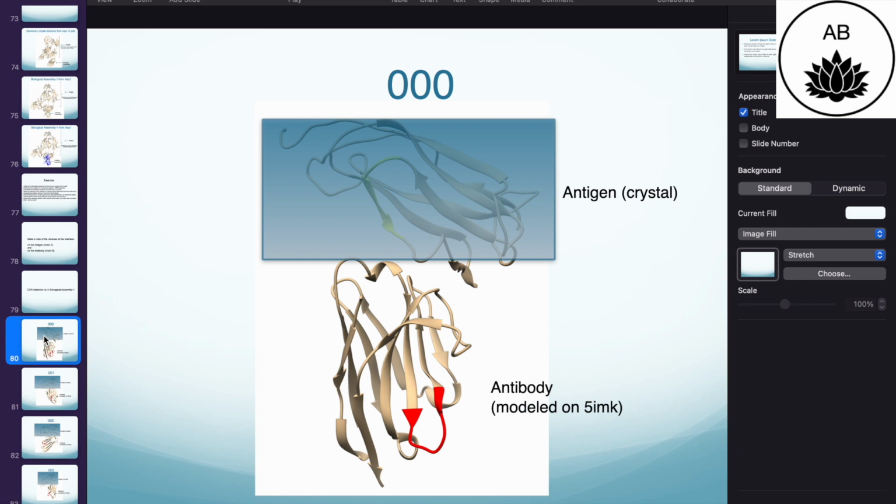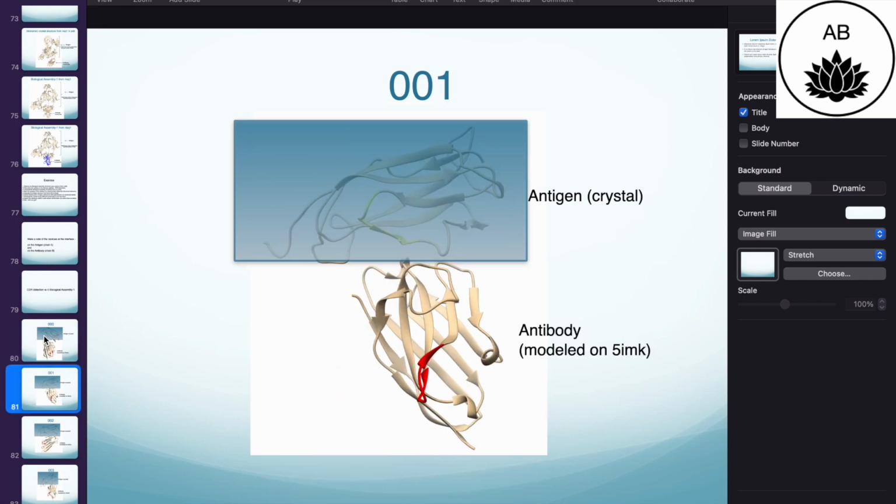So I'm not considering the antigen. Okay, so just focusing on the antibody and seeing where the CDR is going, the little beta sheet structure that I showed you. Definitely, it is not being presented as CDR when it comes to this particular conformation. No.